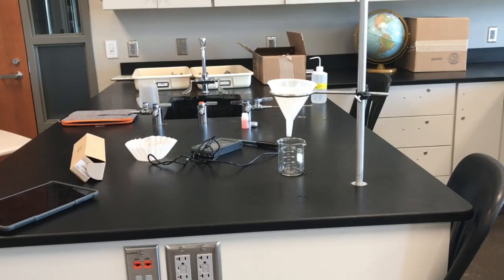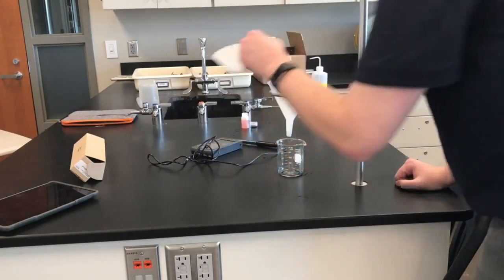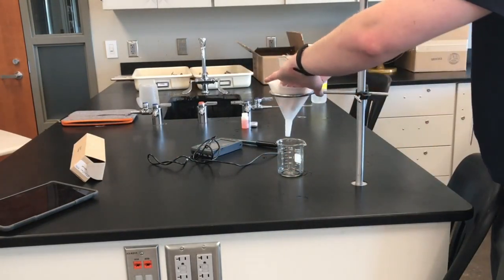Okay, so this is going to be our setup for part 2. It's going to be very similar to the same setup that we just did, but now we're going to be using soil B. So once I've cleaned out everything, I'm going to replace a beaker under the funnel. I'll put on a new coffee filter.